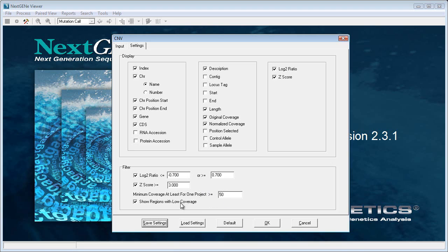However, you can still show these regions in order to get a more consistent report that lists all of the regions in your BED file. If they both fall below this threshold, we just won't calculate a ratio. If you're looking for specific individual positions, it could be useful to filter based on the log2 ratio or the z-score. But if you just want to get an overall picture and have a consistent report listing one row for each amplicon in your BED file, you can turn off these filters.